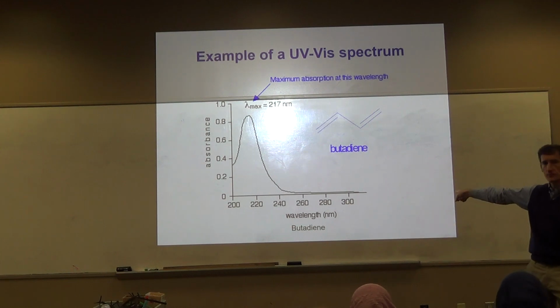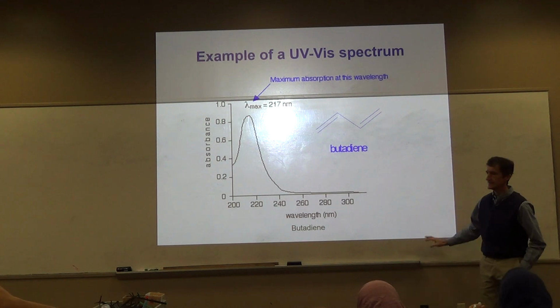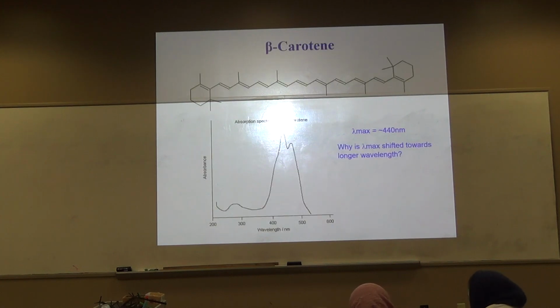Does butadiene absorb visible light? No, I don't see anything out here. Again, we keep going if there was anything out here to see. And so it should be colorless. Does that compound absorb any visible? Well, they kind of stopped it there. Doesn't seem to.